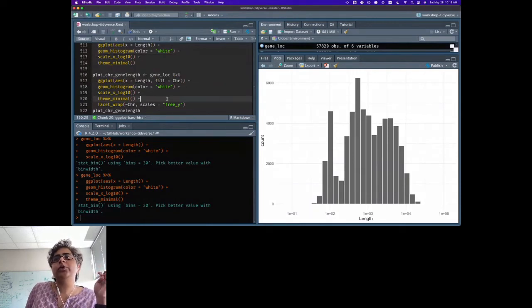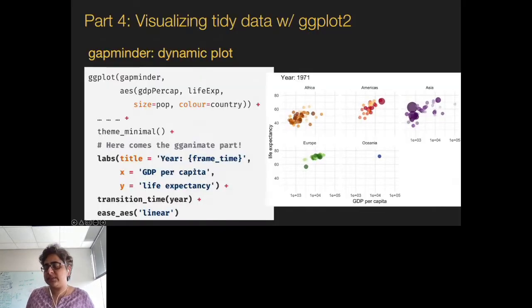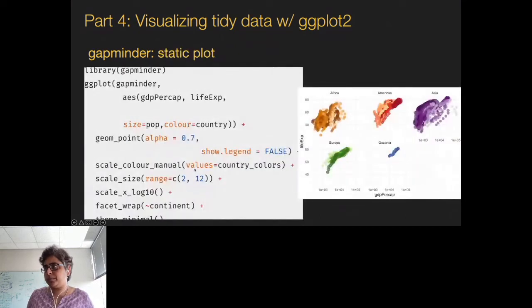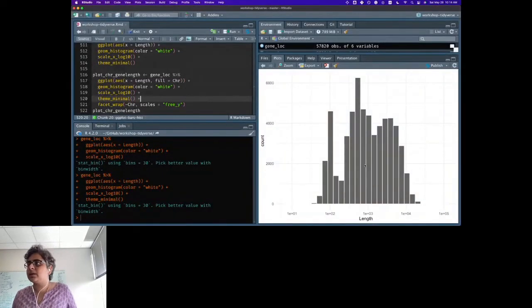So next, what are we going to do? I showed you this faceting, right? For example, if you go back to the slides, I showed what the facet does is basically it creates multiple subplots. We want to see if maybe instead of doing this bulk across all the chromosomes, what if I facet it by chromosomes?